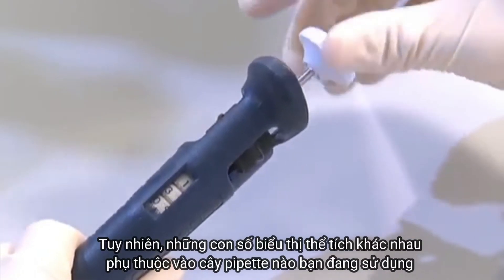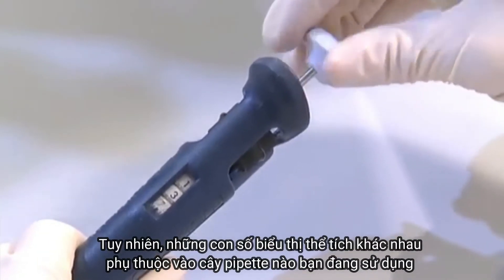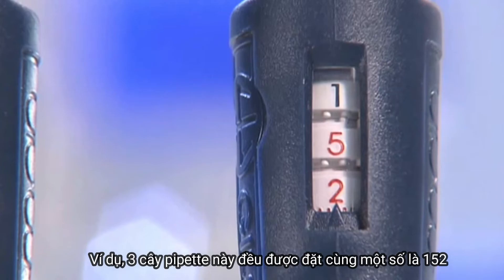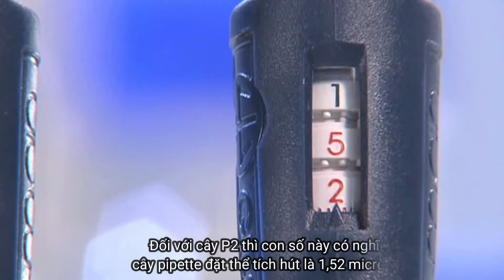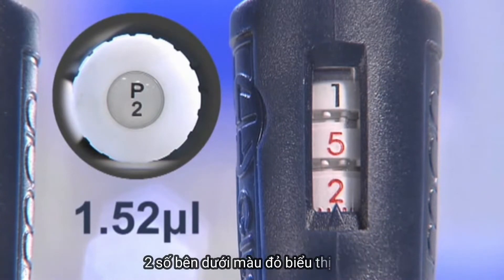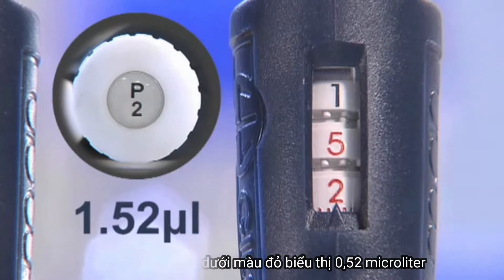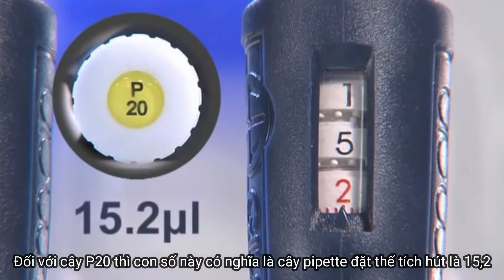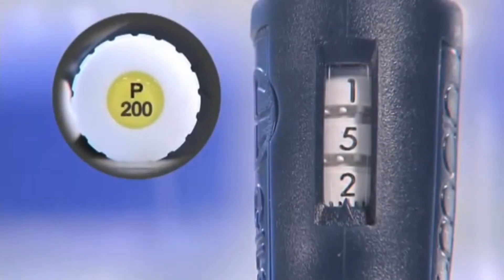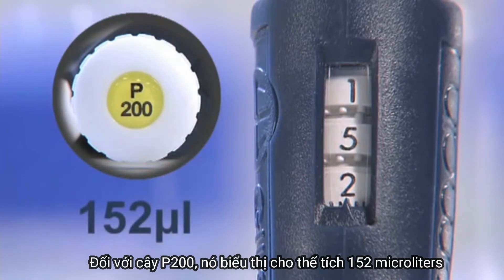The dial numbers indicate different volumes depending on which pipette is used. For example, these three pipettes have been set to read the same numbers on the dial: one, five, two. For the P2 this means the pipette is set to 1.52 microlitres — the bottom two dials are in red indicating five tenths and two hundredths of a microlitre. For the P20 this means 15.2 microlitres, with the red bottom dial showing two tenths of a microlitre. With the P200, the same visual setting means the pipette is set to 152 microlitres.